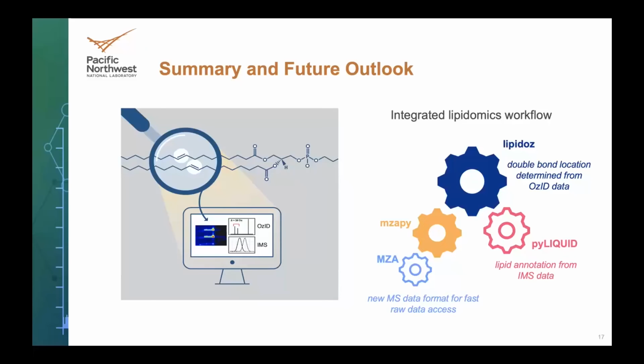And this whole suite is built on top of ultimately the EMSL open mass spec data format, developed by Ivet. This is really awesome, and I think it's a good example of when you remove the restrictions that are imposed by relying on certain vendor formats. It makes it really easy to build application stacks on top of that.